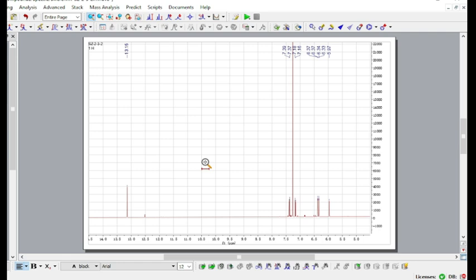Now, NMR is one of the techniques used for structure elucidation, and there are other techniques as well which you can use for getting different information about the structure of a particular molecule. So all these techniques complement each other, and the information that you get from all the different types of techniques like mass spectrometry, IR, NMR, and UV visible spectroscopy, you combine them, you connect the dots, and you get the structure. All right.